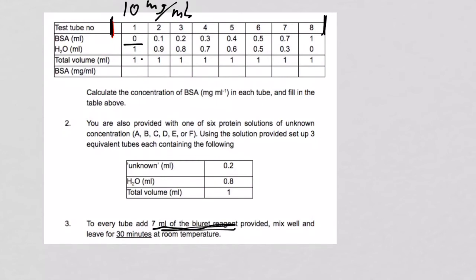And you've got this whirly mix on the bench, where when you put your tube on it, it goes, yeah. So you can use that as long as your solution stays inside the tube. If it goes like, yes, a blender without a lid in the kitchen is absolutely fantastic, especially when you do beetroot juice. Not recommended. I've done that once, learned my lesson. So mix it very, very well. Okay?